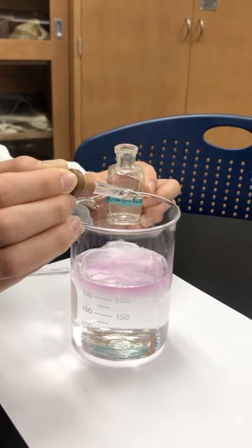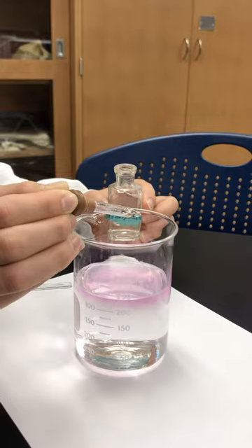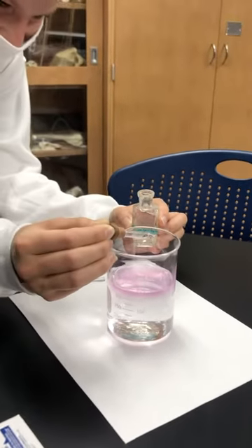So Allison is going to add 20 drops, which is probably hard when Mrs. Messersmith is talking over her.